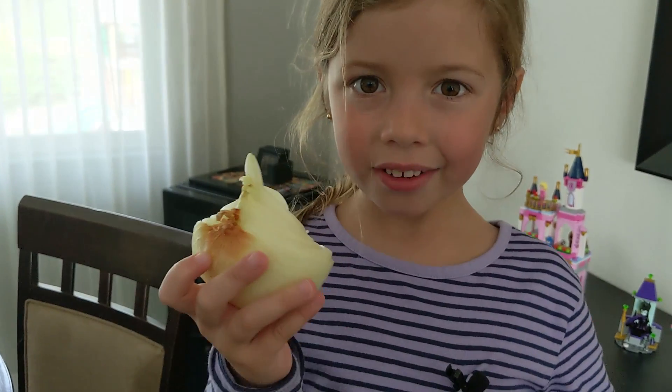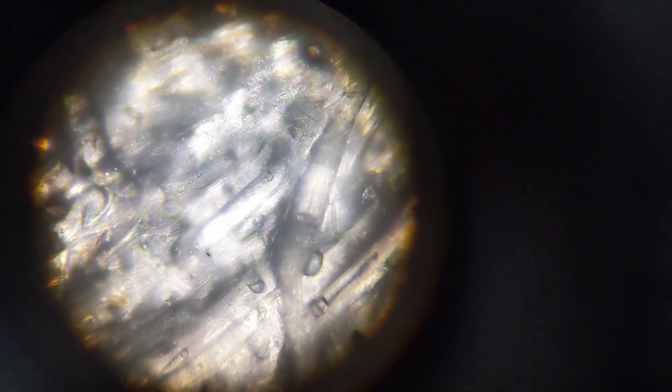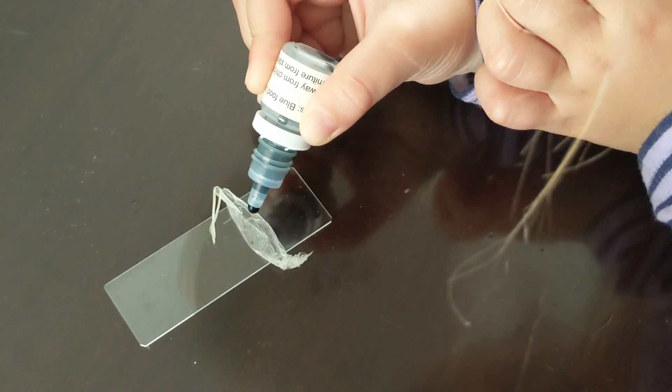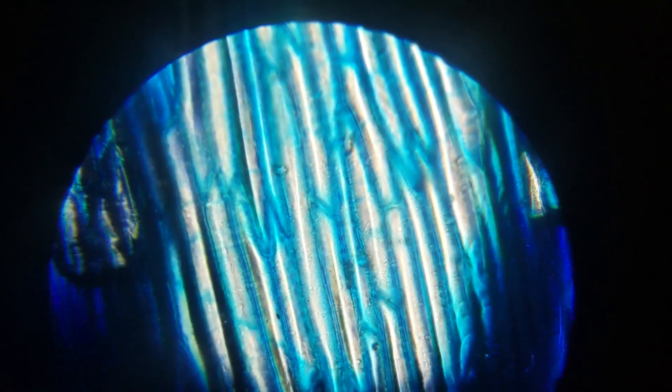Finally, we're going to check out some onions. That's cool — it looks like bones. Let's try it with some of this dye. Now you can see the cells that make up the onion. Here it is further back.